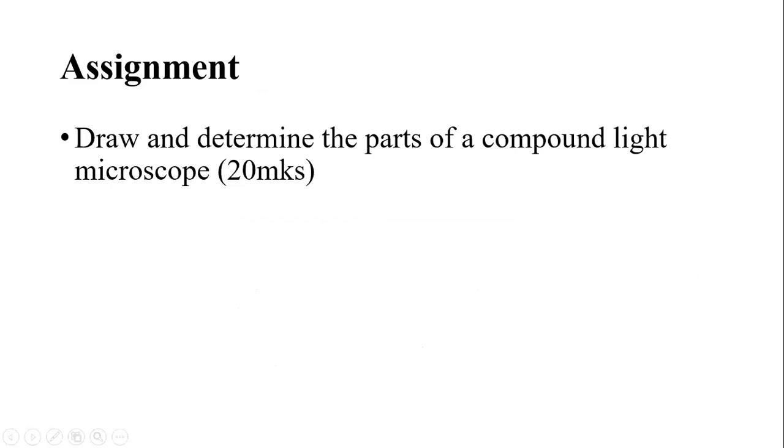And I have an assignment for you. Your assignment will be to draw and determine the parts of a compound light microscope, to be submitted next week. So that is the end of our lesson today.